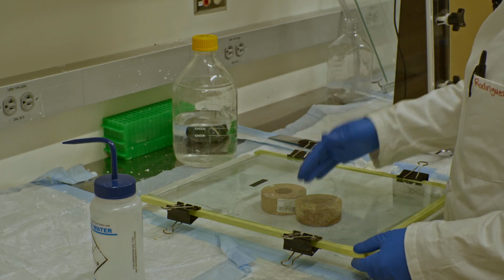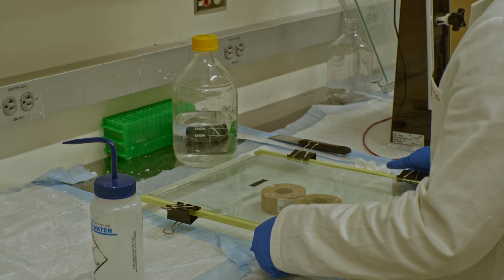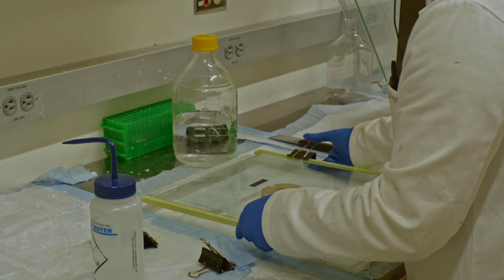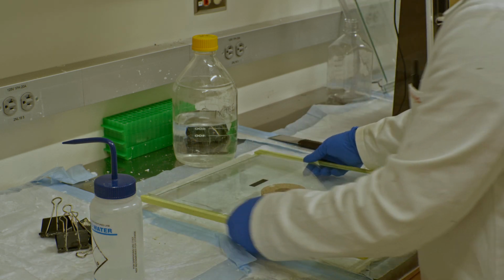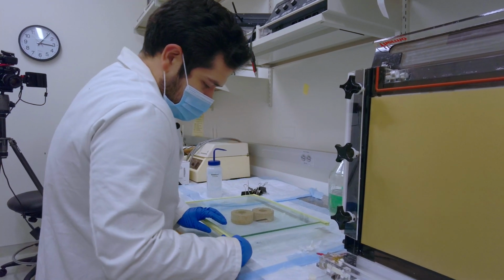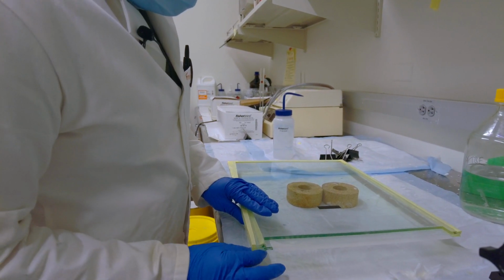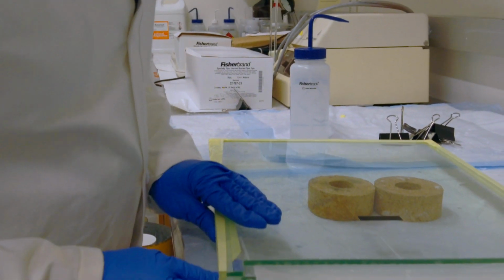So now the gel has set. It's been about an hour. To take it apart, to set it up in the actual gel box, you're gonna have to take off the clamps from the sides, and then the tape on the sides as well. So you should start with the sides before the bottom, because tape on the sides is on top of the tape on the bottom. This can be a little tricky, so just do your best.